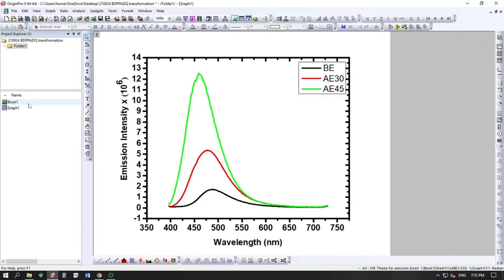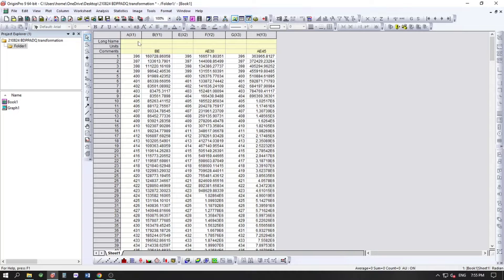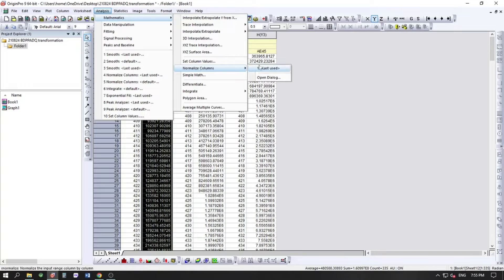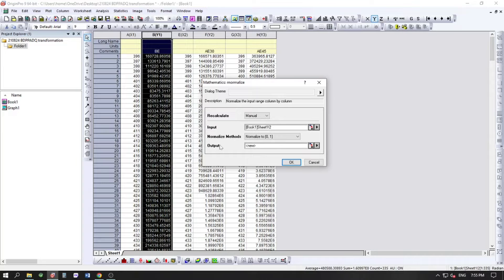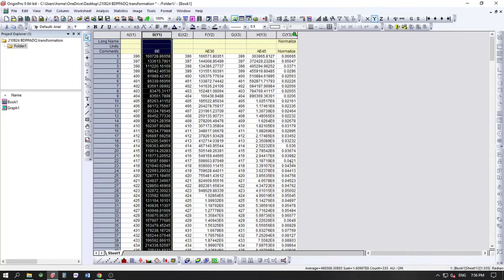First we'll normalize using the software method. Click on the data you want to normalize, then go to Analysis > Mathematics > Normalize Columns and open the dialog. Here you can choose whether to output to a new column or the same column. I want new columns, so I'll go with that.